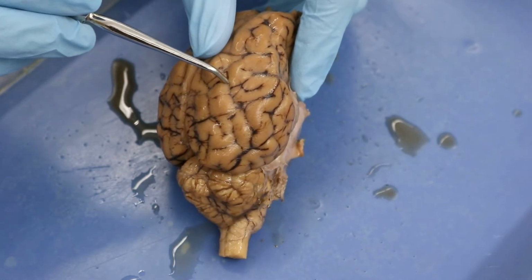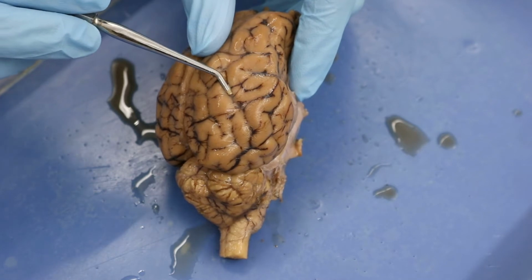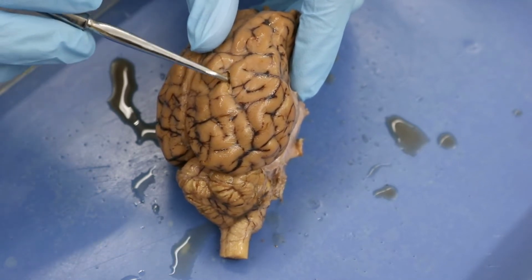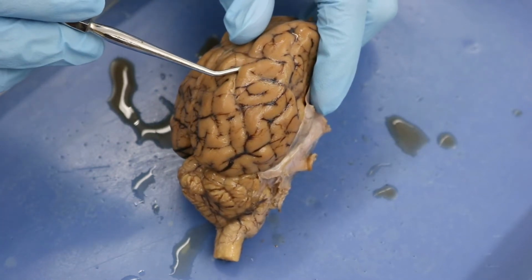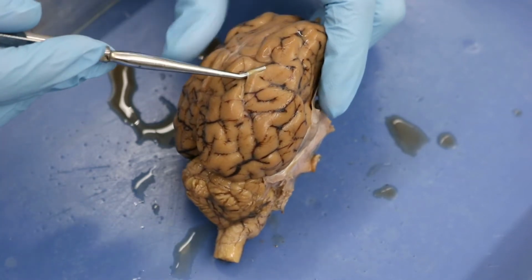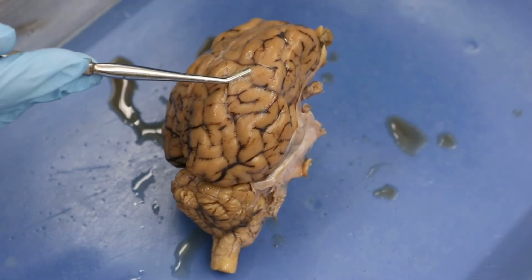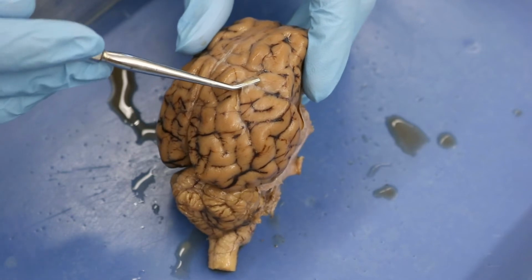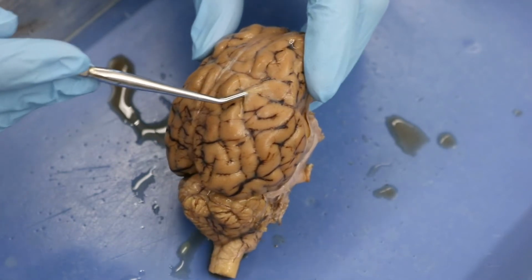And I'm going to see, there we go. I broke through, and when I broke through, you can see that there is a little bit there, and you can easily go in once you break through. But that is your pia mater right there, okay? And there we go. So I'm inside the pia mater. You can see it holds itself up even though I'm not touching it, because the probe is attached to the pia mater, okay?